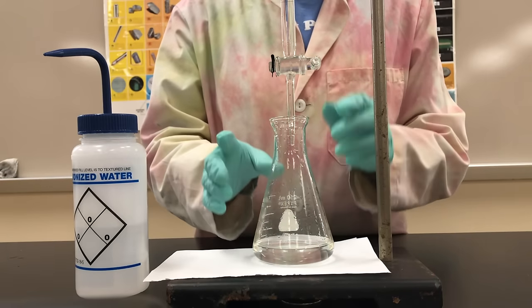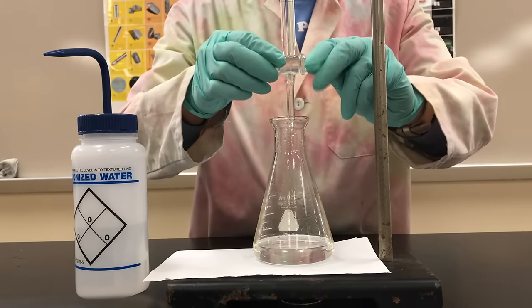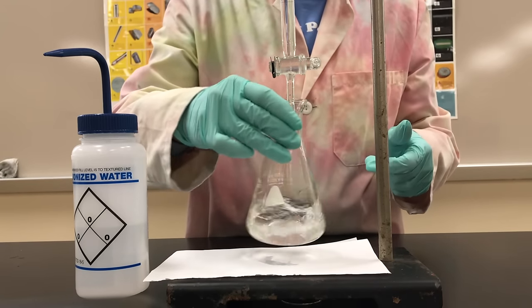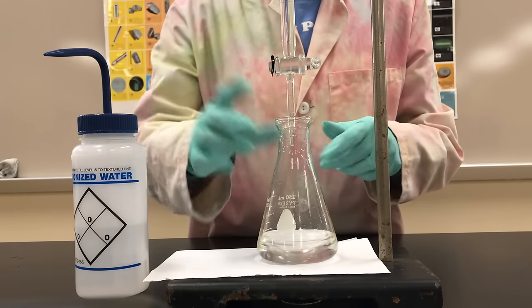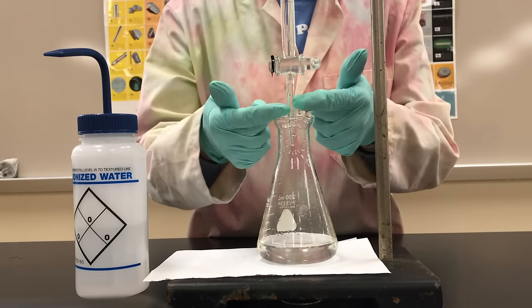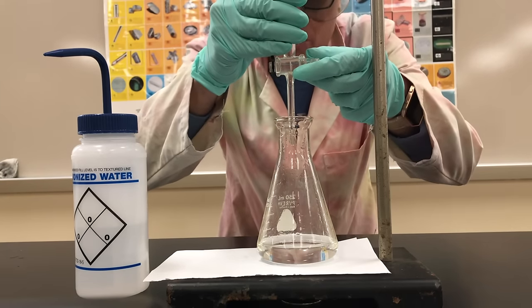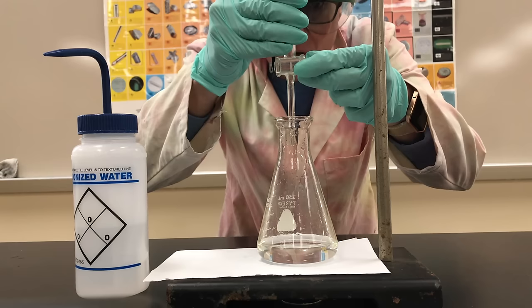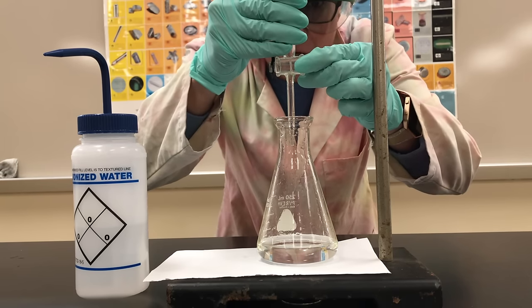Once you start to get really close to the endpoint, and again, you'll see that by just a small amount of color persisting a lot longer, instead of doing a 180, try to allow just one drop to come through the burette tip. You'll usually want to hold with one hand and very slowly turn that stopcock so that you are only allowing out one drop.